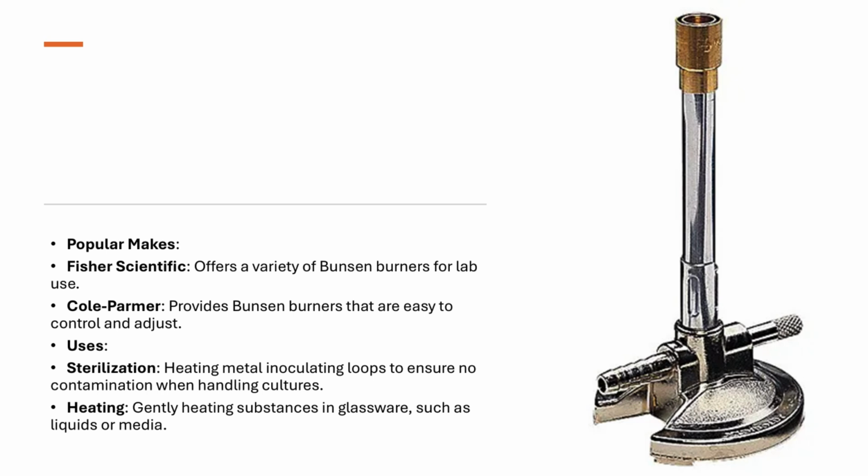In conclusion, the Bunsen burner is an essential piece of equipment in microbiology labs, providing the necessary heat for sterilization and precise temperature control. It helps maintain a sterile environment, which is key to conducting accurate and safe experiments.